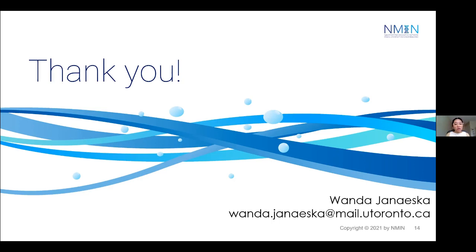Yeah, for sure. So inter-rater reliability refers to the consistency of decisions or classifications between two individuals, and it contributes to the validity of the data. So when two people are annotating, for example, with a differing degree of expertise or experience, when they're looking at a TEM image, it may result in different outcomes. However, the algorithm allows us to remove this knowledge imbalance entirely so that all decisions are dependent on the network, which the algorithm is based upon.